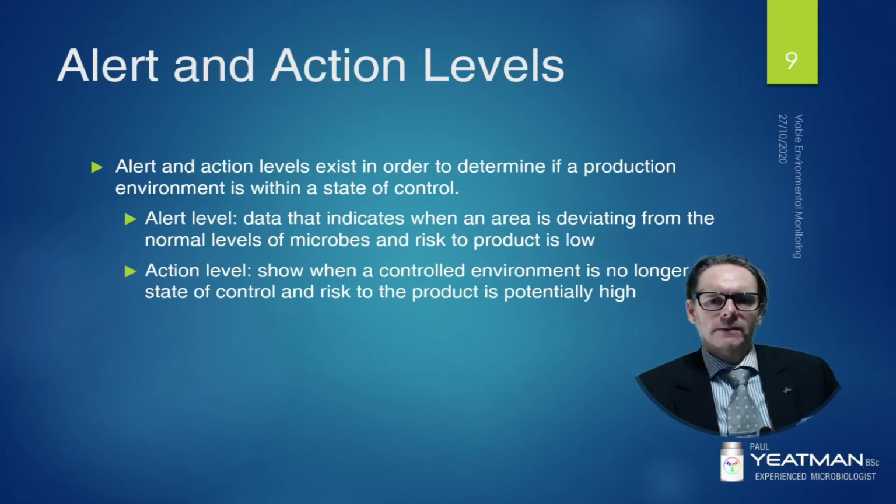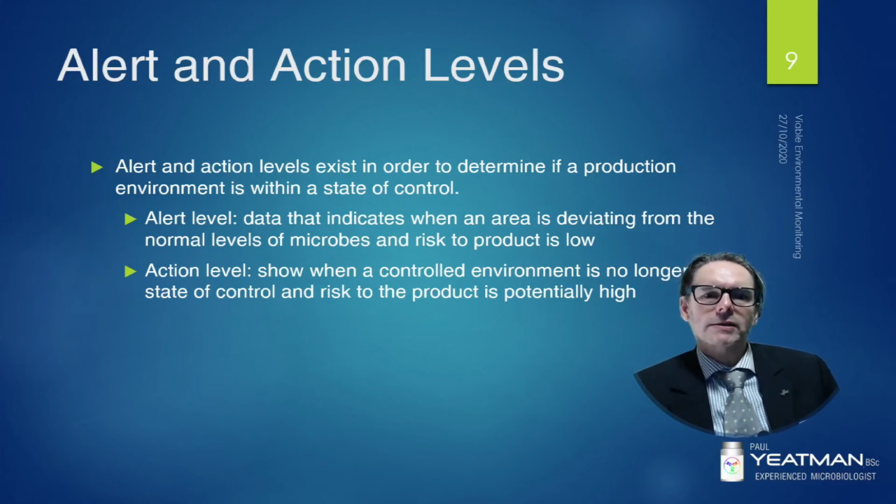for sale. With an injectable product, the worst case situation would be the contamination kills your patient, and that's not good, both for the patient and for you and for the company, potentially for share price and potentially for your company's continued existence. So any action level result must be fully investigated and any conclusions you draw from the subsequent investigation must be justified.